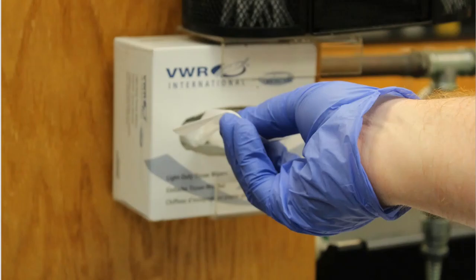All right, so before I get finished with my refractive index, I'm going to go to my chem wipe. A chem wipe, think of it as a tissue that you would maybe clean your glasses with. It's a very smooth surface. We don't want to use any paper towels on the refractive index and the prism because that could scratch or damage it, and chem wipe is always the thing to go to for these.